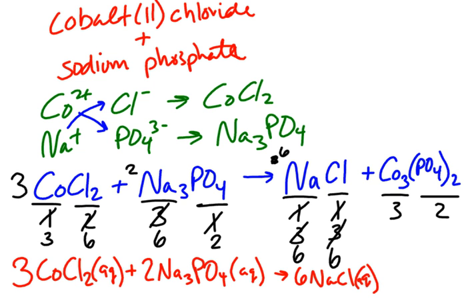And then the last one is cobalt phosphate, and I only have one of them, and cobalt phosphate is a solid.